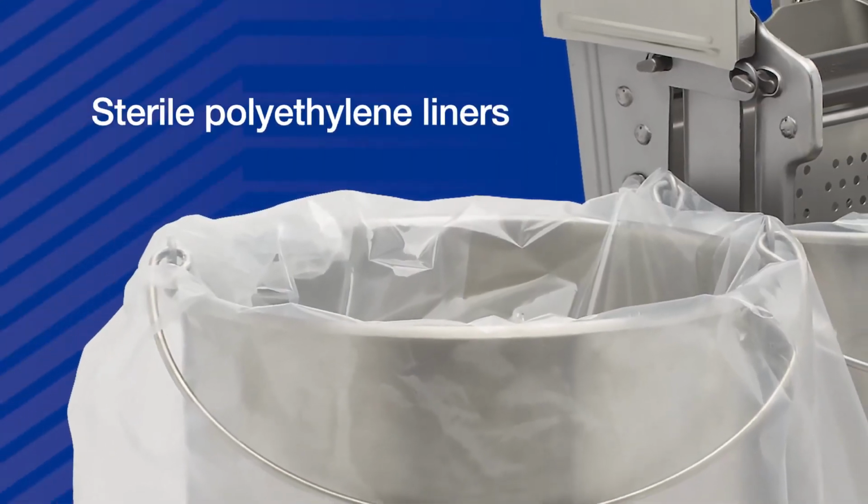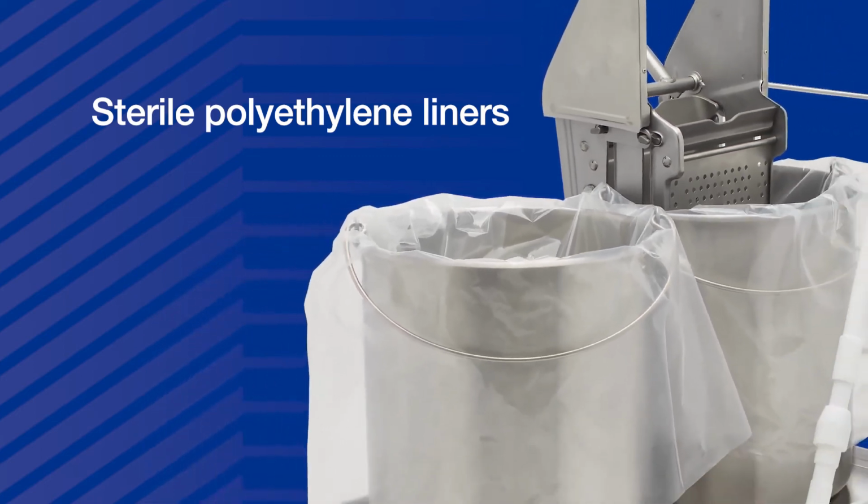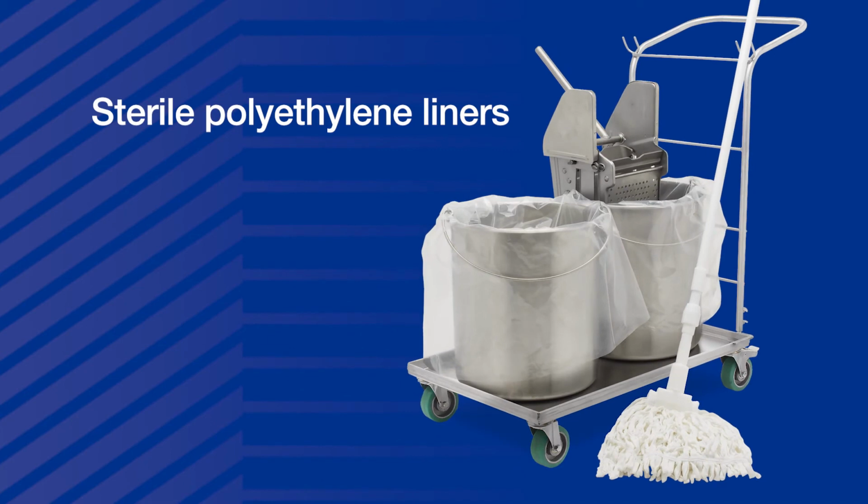Sterile polyethylene liners may be used in sterile areas to further protect the sterile disinfecting solution. Also, the liners protect the buckets from disinfectant exposure, extend the life of the buckets, and aid in easier cleanup.